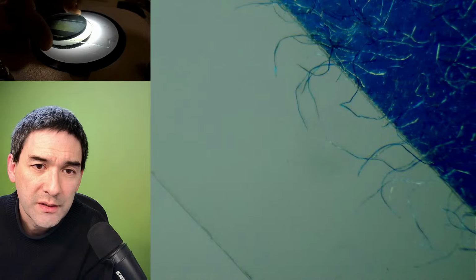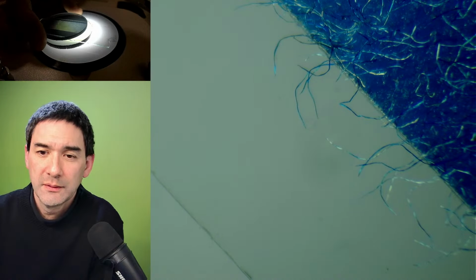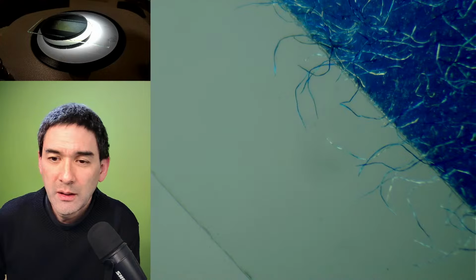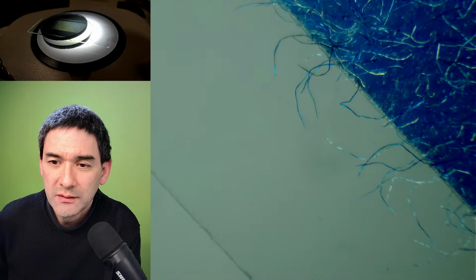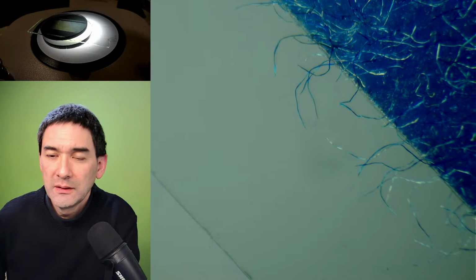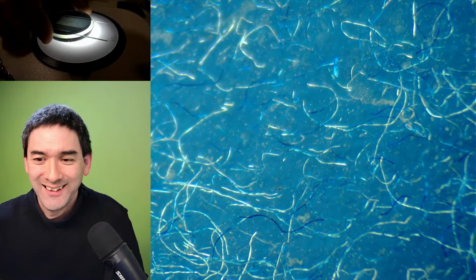And here you can see again the edge of the tape. I'm reading some of the comments again. Yeah, here we go again. It's sometimes kind of fun just playing around like that.